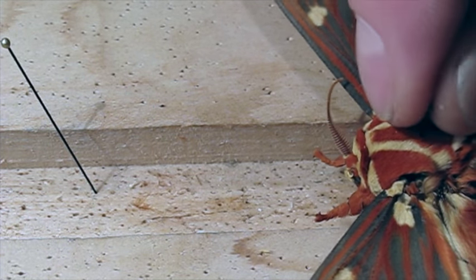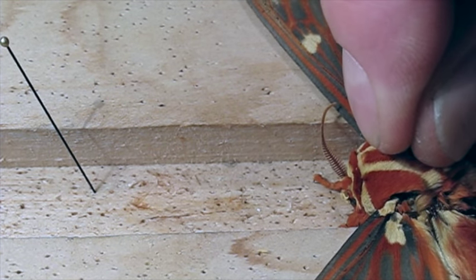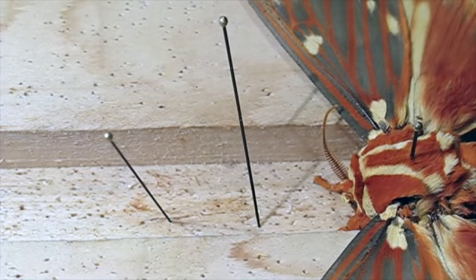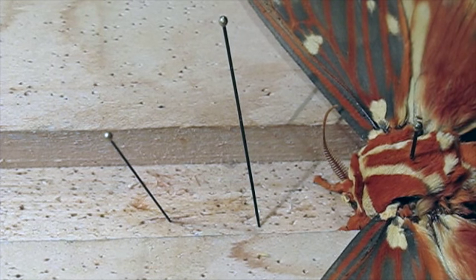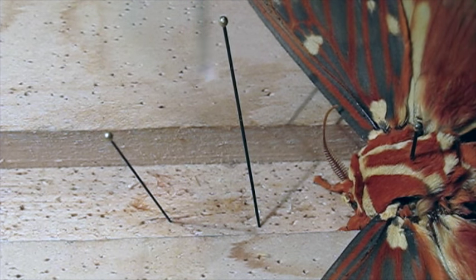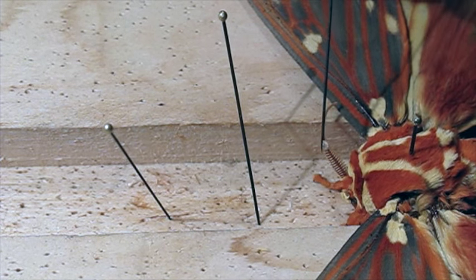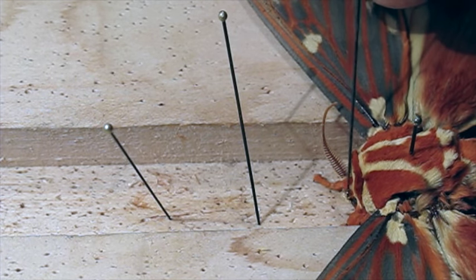Now reattaching an antenna is a useful skill to have. It happens pretty regularly — they break off. So I'm going to put the antenna nice and straight in the slot there. I'm going to put a couple of small pins as props, and then I'm going to use a small pin to place the glue. We're using a blue gel, water-soluble blue gel. I get a little bit of glue on the tip of the pin and I'm going to put this on the little stub where the antenna was attached on the head, and tap it onto there so that it's really coated with glue. That'll help the antenna stick.